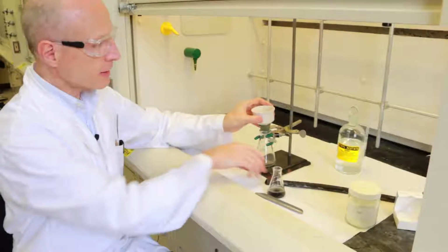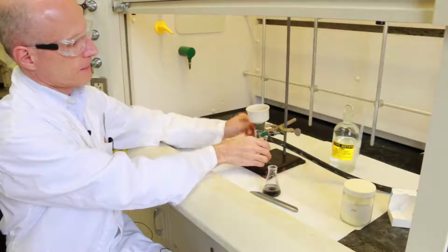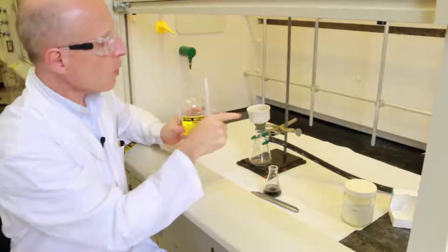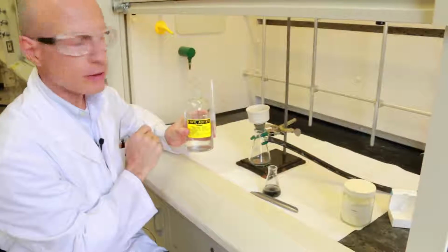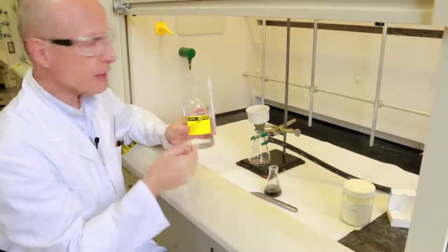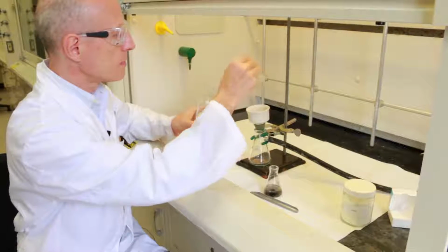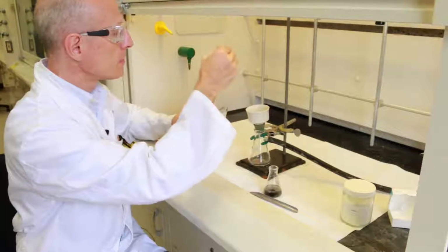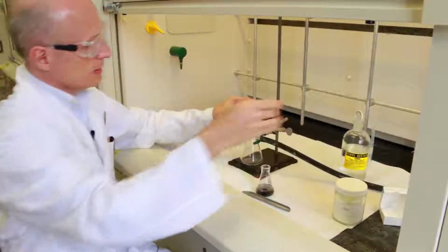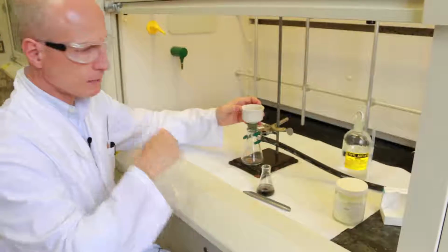Then you set up your filtering apparatus and clamp the filtering flask. As usual, you want to wet the filter paper before you start filtering. So you use the same solvent that you have in your solution. In my case it is ethyl acetate, so I will use ethyl acetate. Now your filter is nicely stuck to the bottom of the funnel.